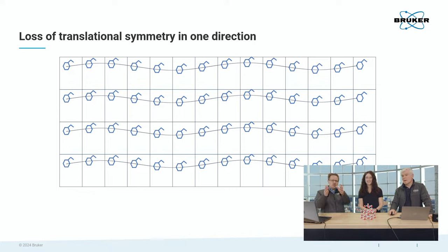Now, could you have it where, say, the second row was shifted out of phase with that? Right, so the top one dips down, the other one dips up at the same point. Would that still be called a modulated structure? Or do they all have to deviate in the same direction the same way? I guess if you would introduce a second modulation function in the columns, this is exactly what would happen.